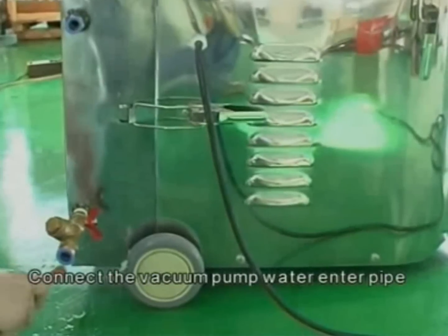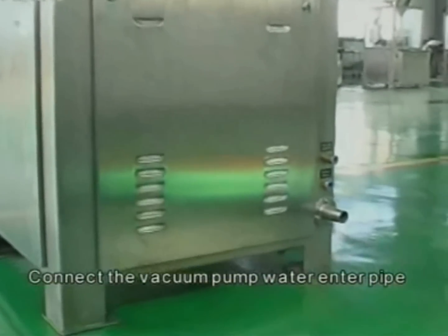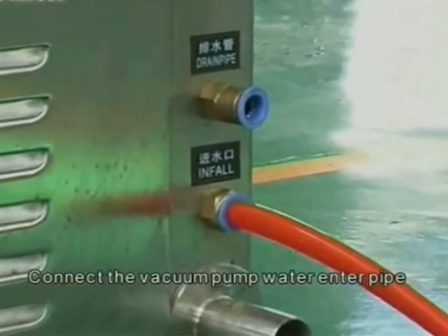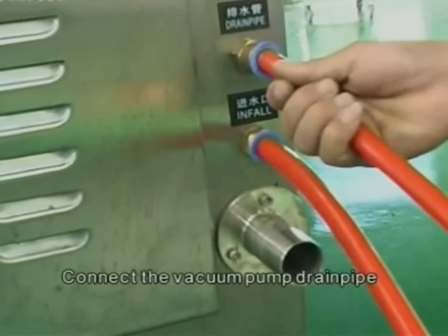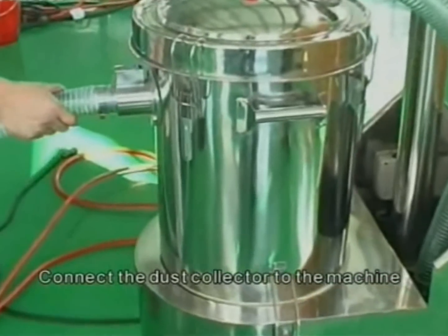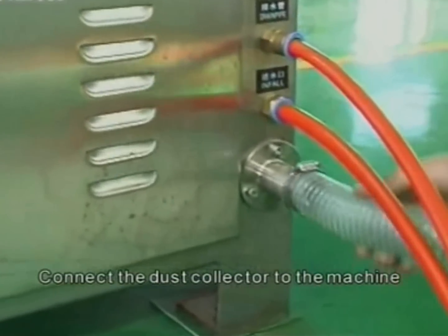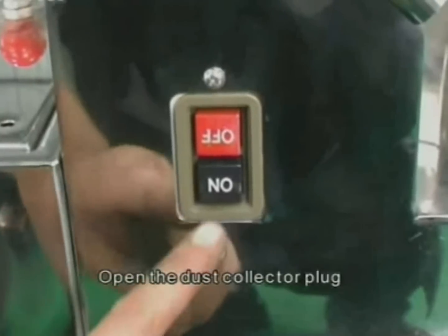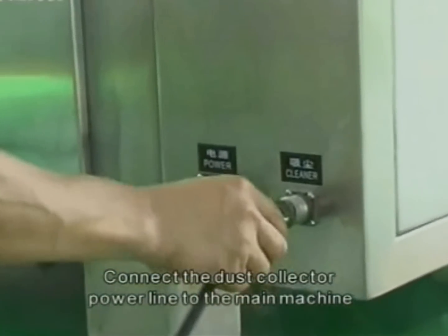Connect the vacuum pump water inlet pipe. Connect the vacuum pump drain pipe. Connect the dust collector to the machine. Open the dust collector plug. Connect the dust collector power line to the main machine.